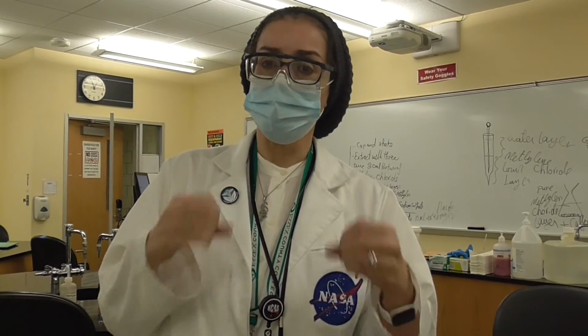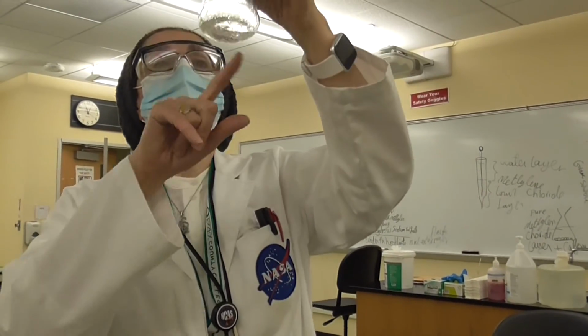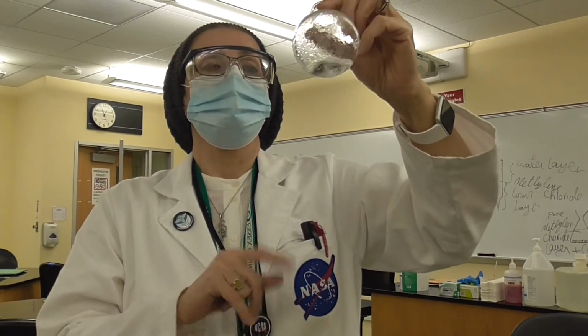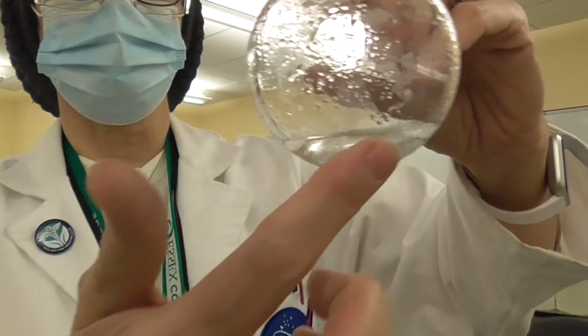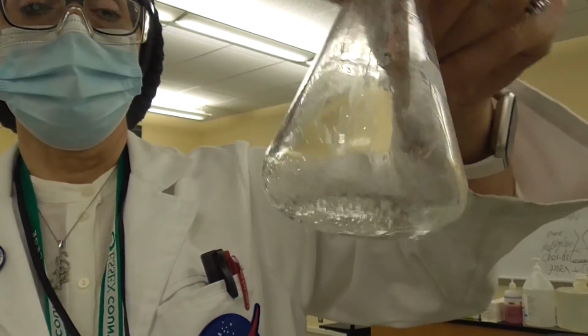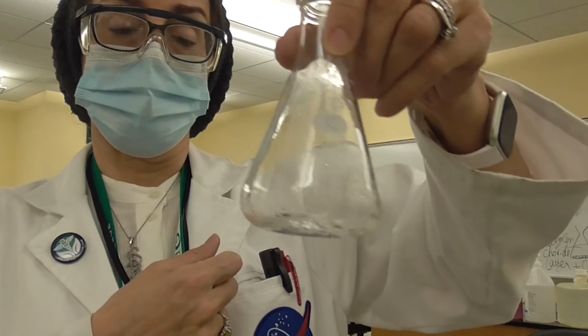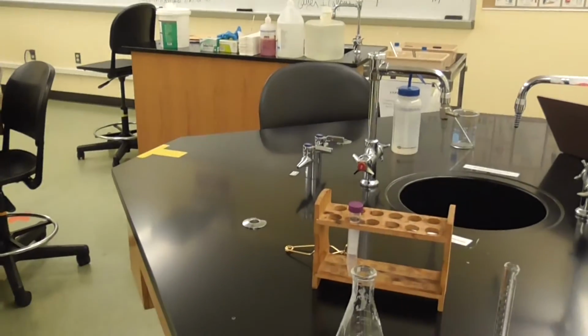That will take most of the water that could be transferred into that layer. I believe there are some of these dots, like here, bubbles, that are some of the water. So that will be removed by the anhydrous sodium sulfate. I'm showing the little bubbles, the water that you're talking about. You see there are like drops of the water, and that will be sucked. In other words, it is going to be absorbed by the anhydrous sodium sulfate after we finish the third extraction.